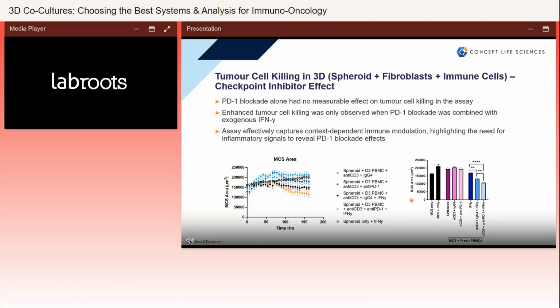What we had to do though was activate PD-L1 on the A549s by incorporating interferon gamma. Once we incorporated interferon gamma into the culture system, during the development of the spheres, that was sufficient to then allow us to manipulate. When we incorporated anti-PD-1 into the system, we got a significant reduction in the growth and the viability of those spheres. When we didn't have the interferon gamma, there was no effect, so it's similar to what we saw in the 2D system.